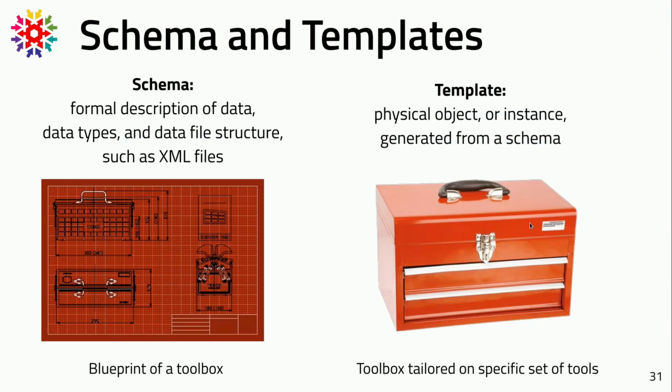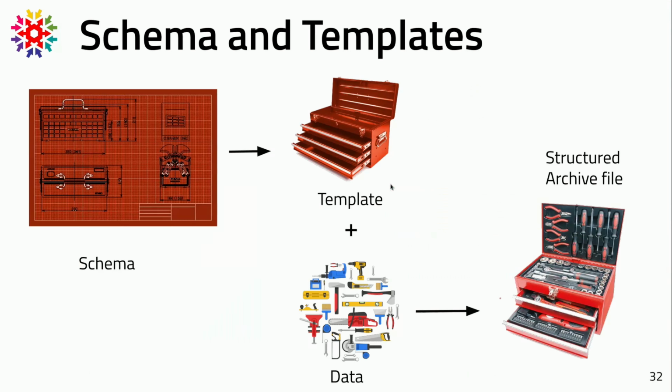What do we do with these schemas after we generate them? We have this blueprint describing our structure. What we can do is generate a template, which is an empty file that is structured on the shape of the schema that we decided. After generating the template, we can actually fill it with data, and we will show during this tutorial a couple of ways to fill this template. One is the manual way with the ELN, and the other one is an automated way, coding some kind of processing that will be wrapped in a plugin, as shown later.